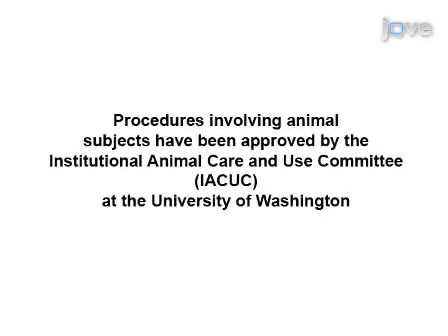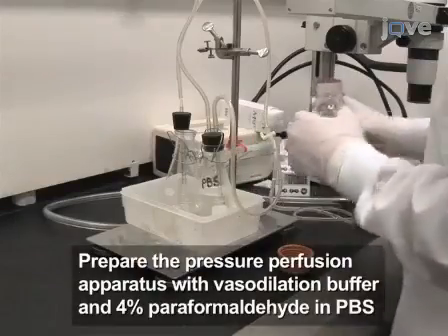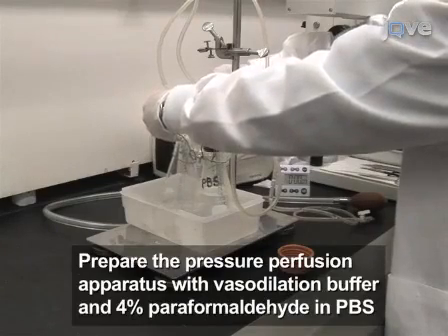If you are unfamiliar with the vessel anatomy, finding and tying off the correct vessels in the surrounding tissue can also be challenging. Before starting the procedure, fill one side of a pressure perfusion apparatus with vasodilator buffer and the other with four percent paraformaldehyde in PBS.